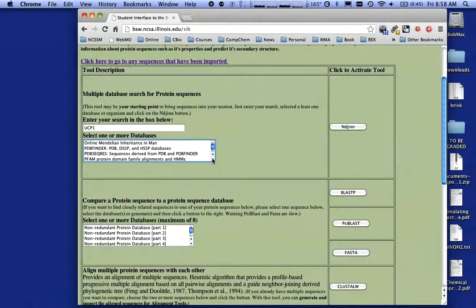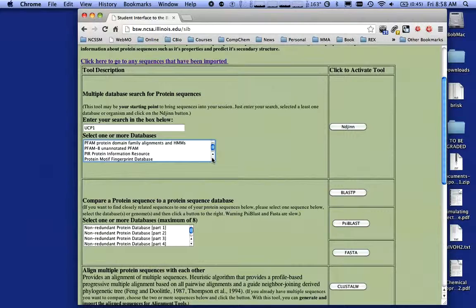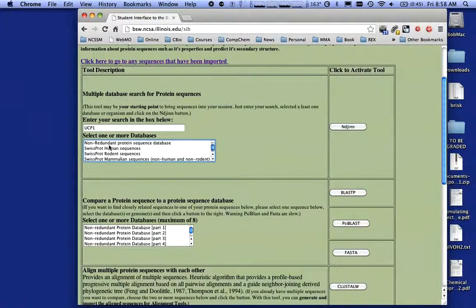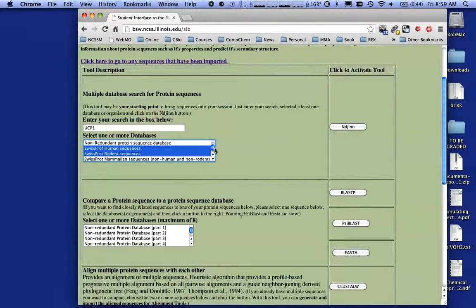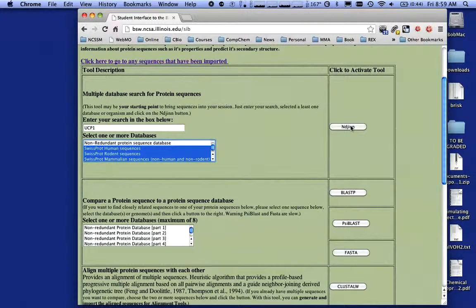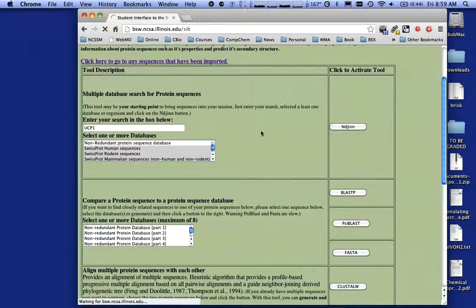There's PDB Finder, PFAM databases, the PIR which is often a good starter database for proteins, a couple of ProCyte ones, and SwissProt, which I like to use most for beginning protein studies. Like GenBank, it has a variety of versions. I'm going to select humans, rodents, and other non-human non-rodent mammals — holding the shift key to select all three — and then hit the Engine tool, which is basically the search tool for multiple databases of protein sequences.